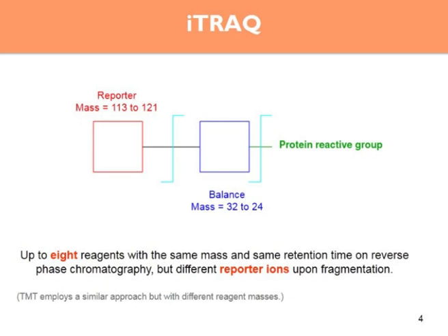I actually don't know how, because Rob doesn't let me touch anything in the lab, or the mass spectrometers for that matter. But you attach this entire thing to your peptides that you want to quantify. But you have up to 4, or actually up to 8 different kinds. You are now able to quantify. In this, I'll just stick to iTRAQ 4 different kinds of conditions.